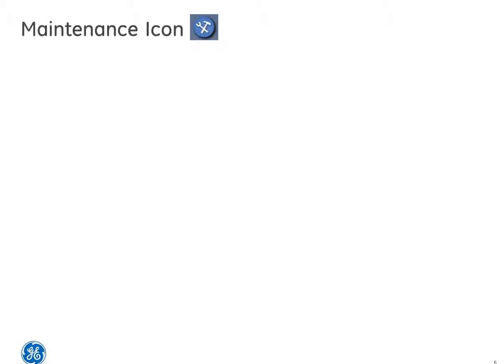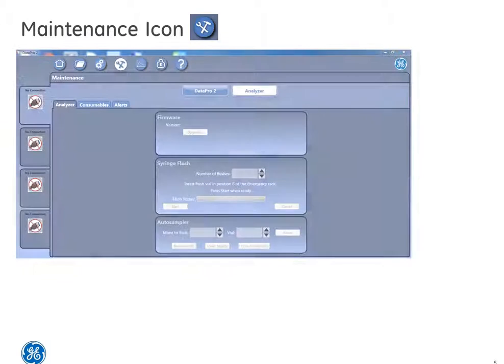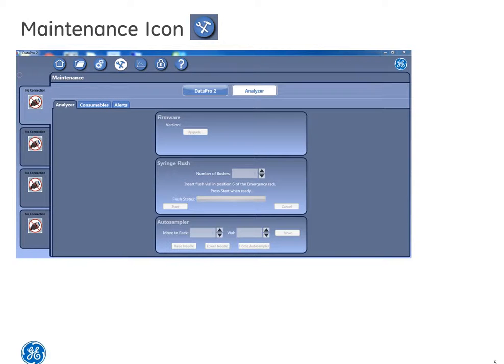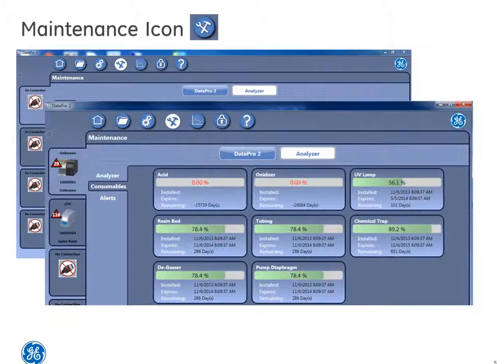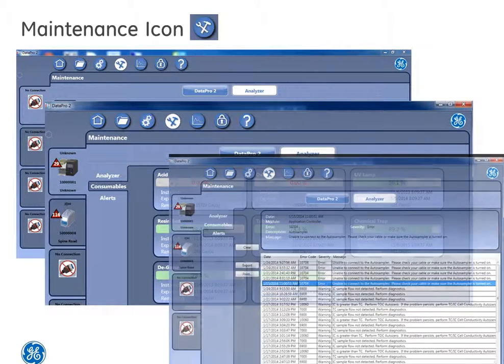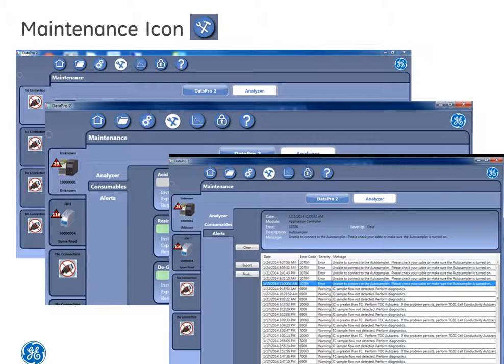Now let's go to the maintenance icon. Selecting this icon allows users to perform backups, archives, check consumables which is really important, troubleshoot issues with the autosampler, or check warnings, errors, and alerts.